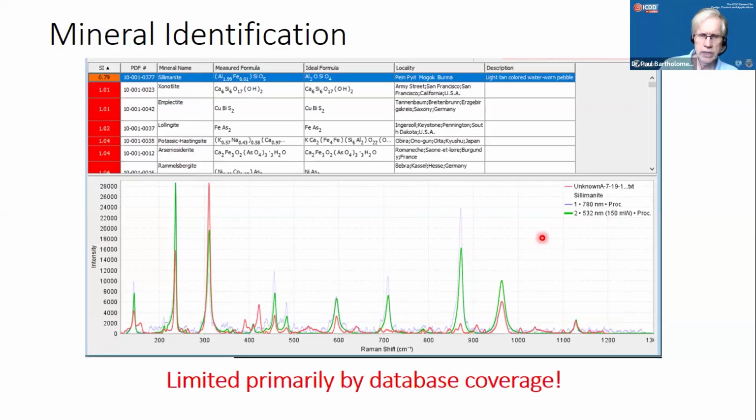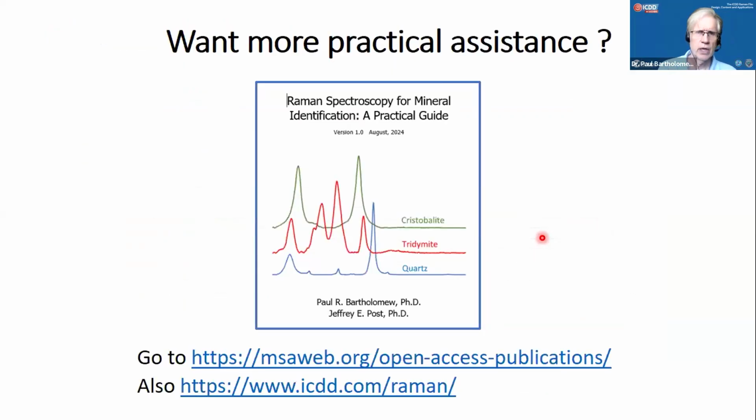I should stop and say this, of course, the topic of the day: your ability to do this pattern match phase identification is limited by your database coverage. So that includes the principles section.